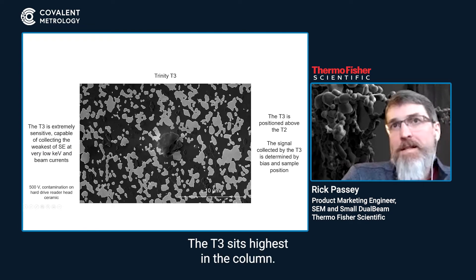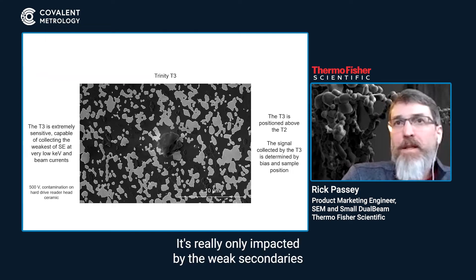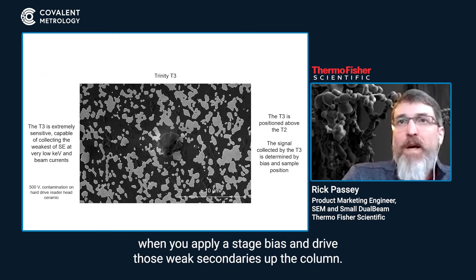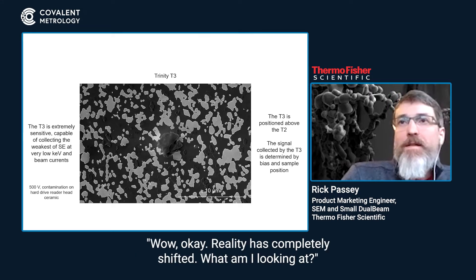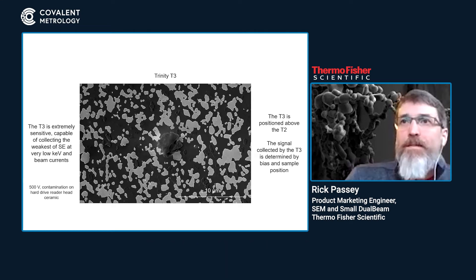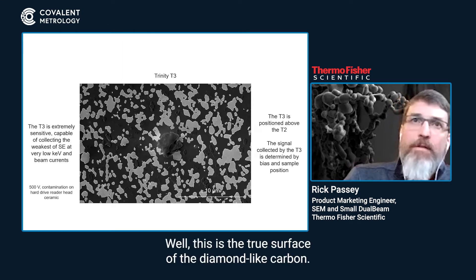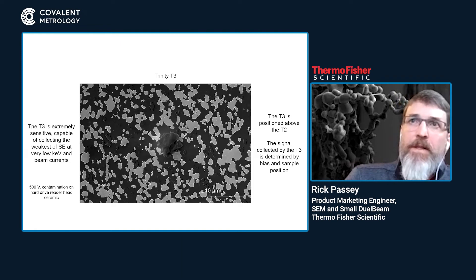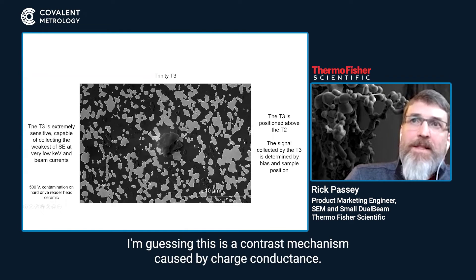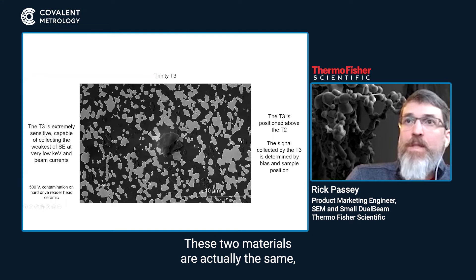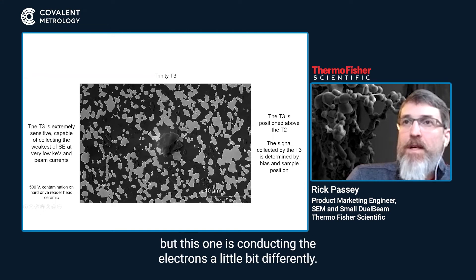The T3 sits highest in the column and is really only impacted by the weak secondaries when you apply a stage bias and drive those weak secondaries up the column. Now we're looking at this and reality has completely shifted — what are we looking at? Well, this is the true surface of the diamond-like carbon. There's some kind of material on top of the diamond-like carbon. My guess is this is a contrast mechanism caused by charge conductance, so these two materials are actually the same, but one is conducting the electrons a little bit differently.